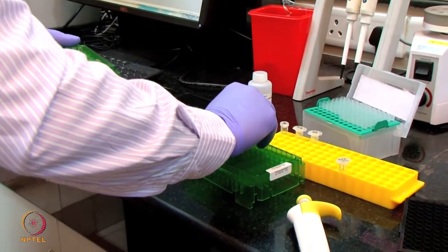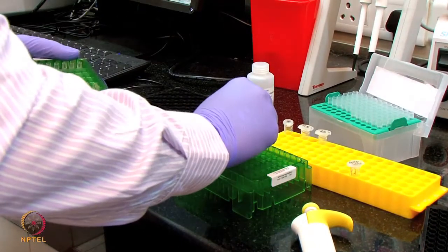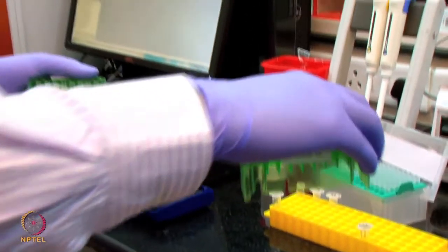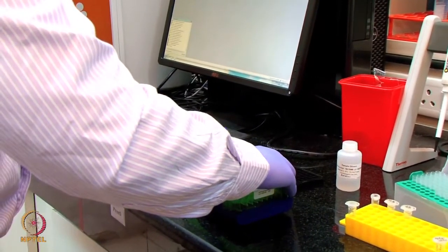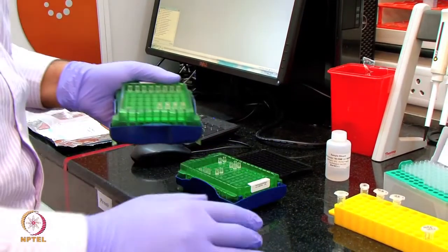This is the sensor holder tray. I am putting the sensors like this. Now this sensor tray I am keeping for the hydration for 10 minutes. So I am going to keep it like this. Now I will set aside these sensors for 10 minutes.